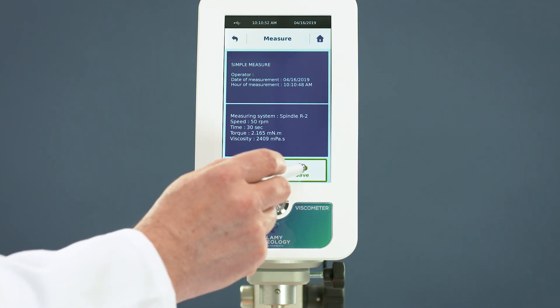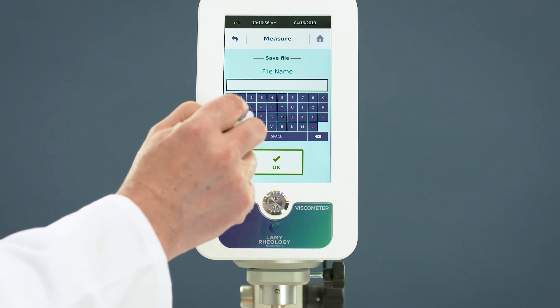After the test, you can save all data in the device's memory to be read or exported later.